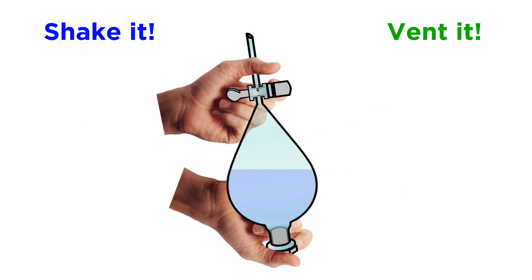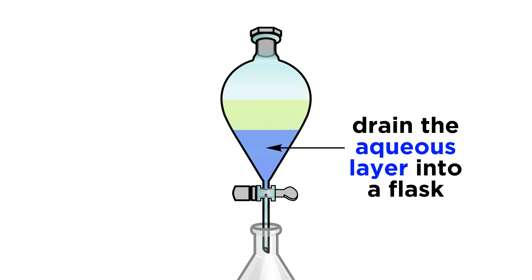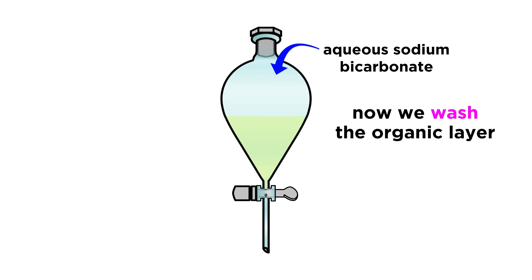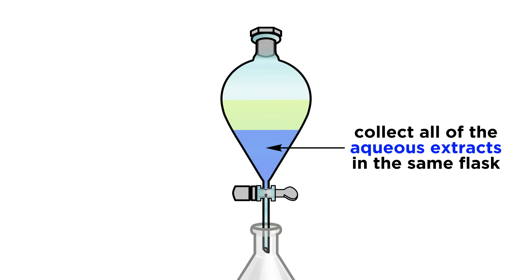We perform the same actions as before, shaking, venting, collecting the aqueous layer in another labeled flask, washing again with base, and then again with just water. And now we have our benzoic acid salt sitting in water, which we can put aside.